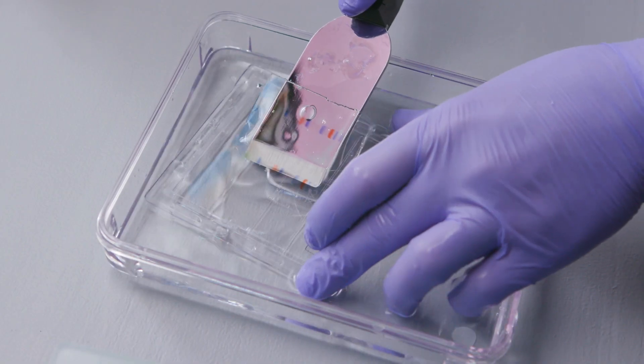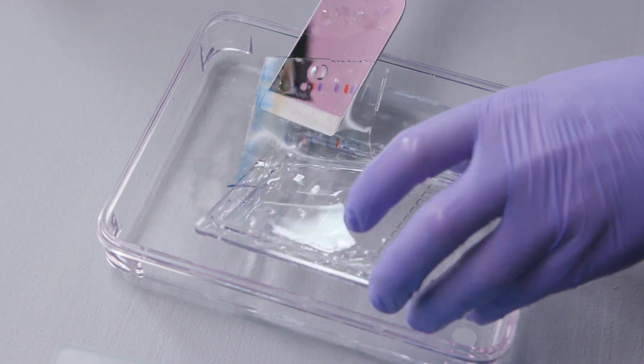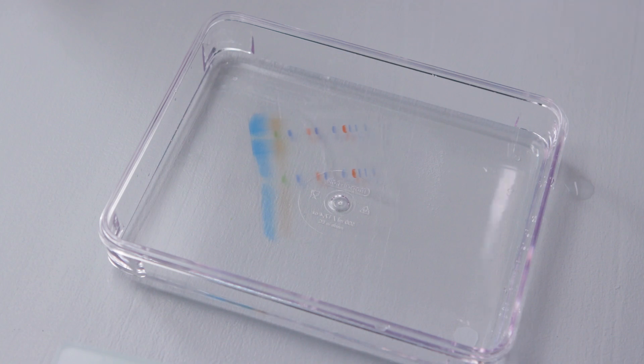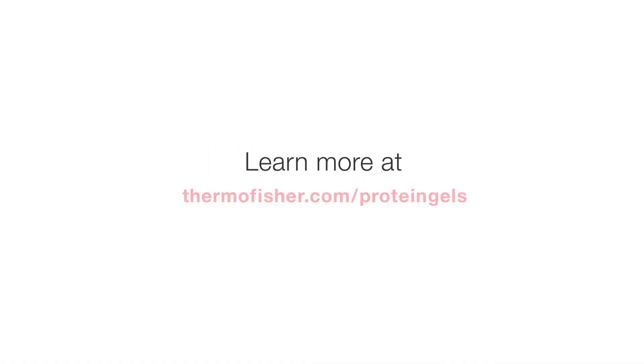The gel is now ready for Western blot transfer, Coomassie stain, or another protein analysis method. Find out more information about Invitrogen precast gels at thermofisher.com/proteingels.